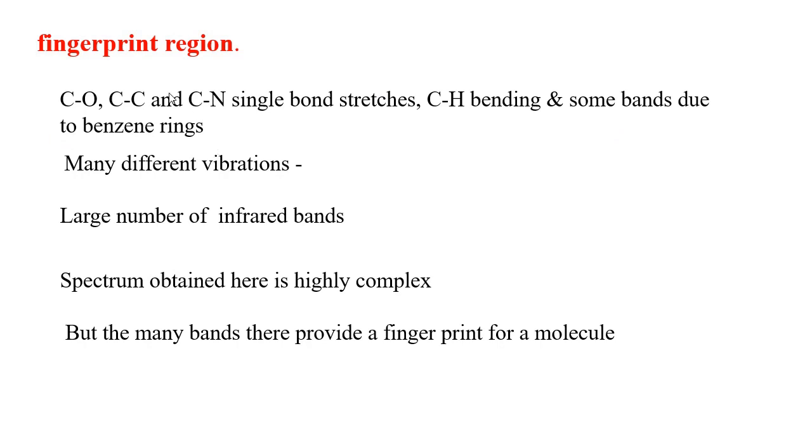Because of these many vibrational absorption bands, a large number of infrared bands, the spectrum obtained here is highly complex.